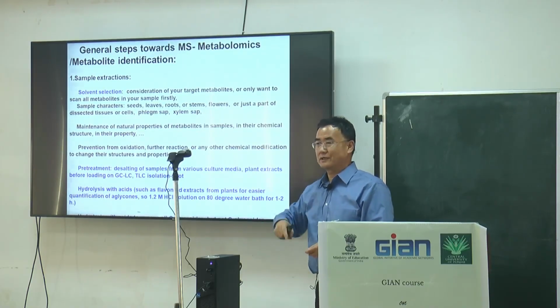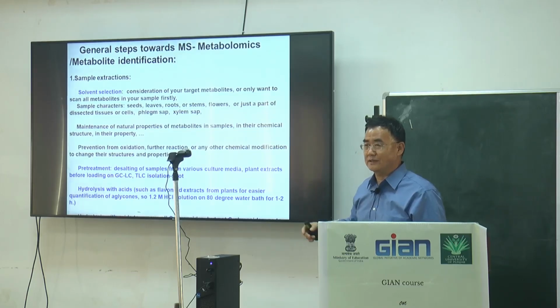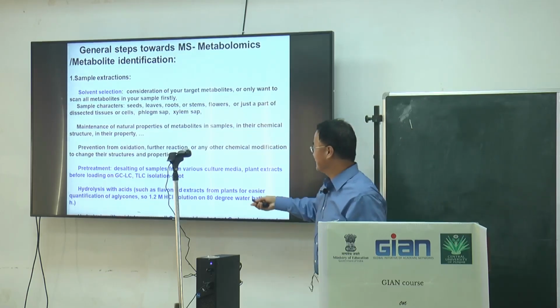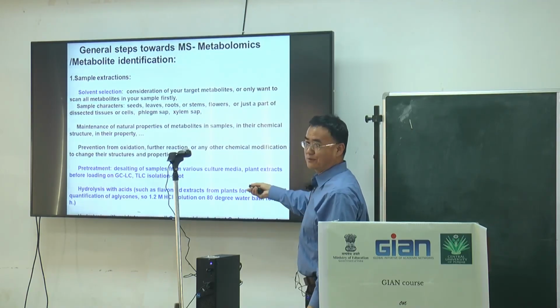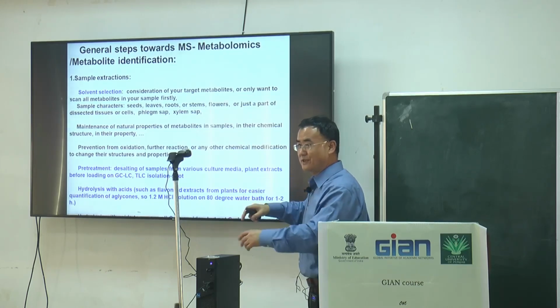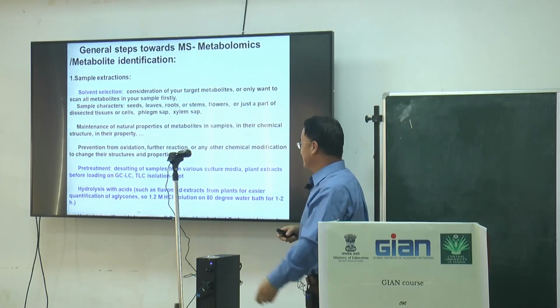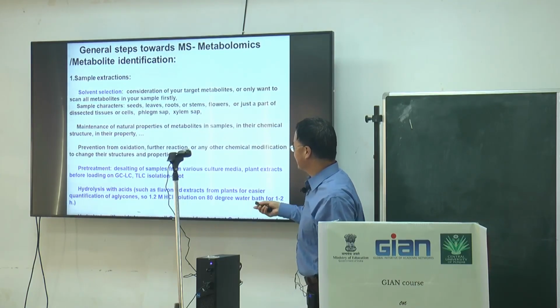Then apply it on HPLC or GC-MS, and you can quickly identify the compound. This is another way that some professors prefer. Our lab also always keeps some plates there, because if we have a chemical structure to be determined, we have to use those.